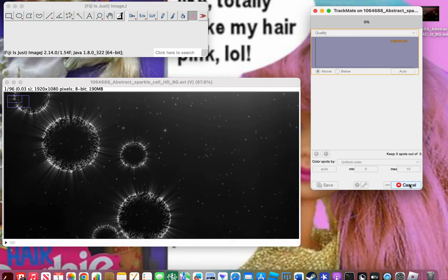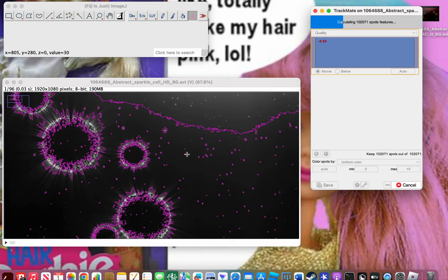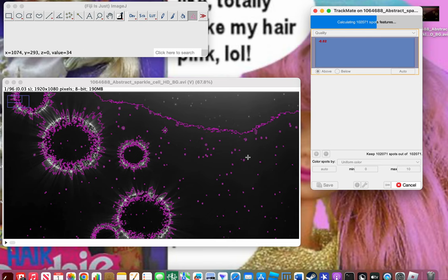Once you get here there are a lot of options. This shows quality — let it calculate first. Auto might select specific objects, but since I'm not looking for a specific object I'm not going to select one. I have a lot of images here that need to be tracked, so if you're not tracking as many small dots as I am it'll be a lot faster. These are cells — the small dots are just random particles.